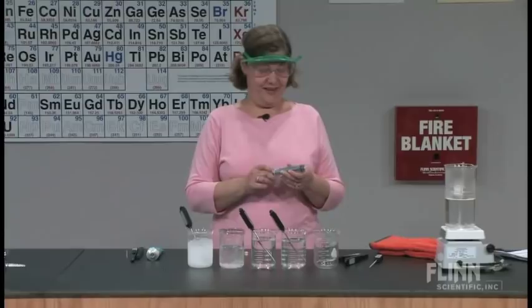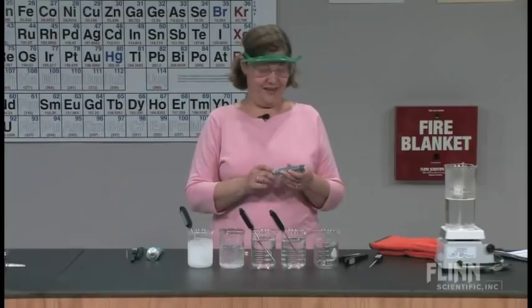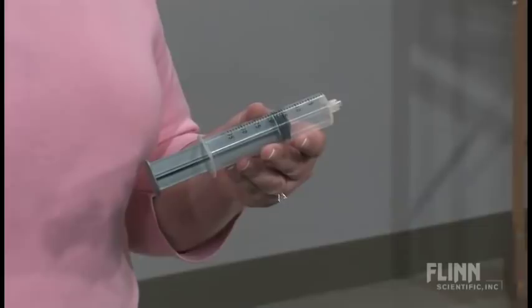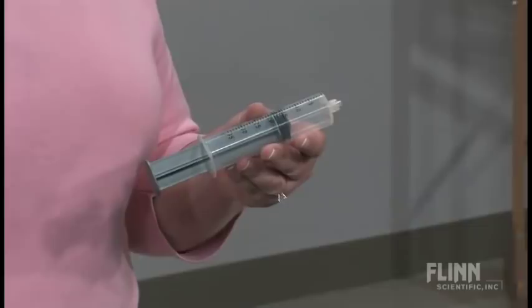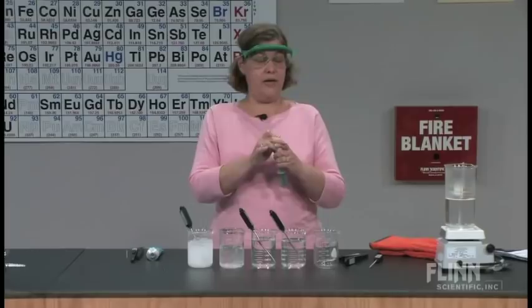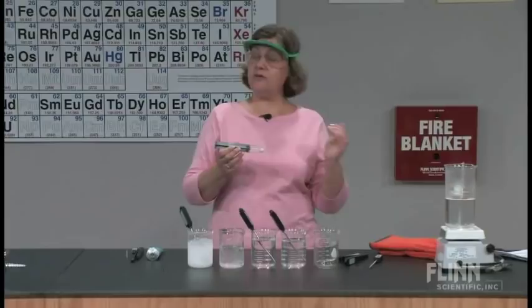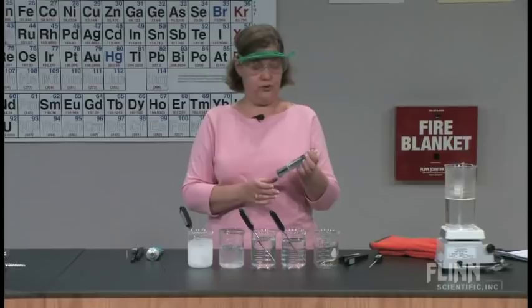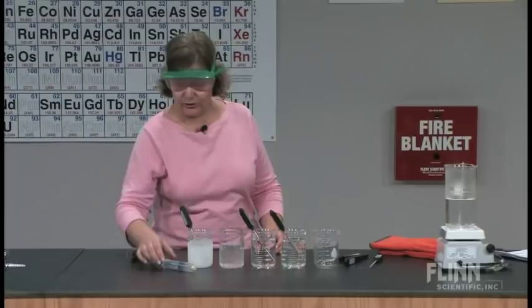What I'm going to do first is simply obtain a sample of gas — a sample of air. I want this about half full, so I've got about 15 milliliters of air in there right now. I'm going to put this syringe tip cap on the end, which is going to trap that volume of air in there — it's not going to let it out, and it's not going to let more air in.